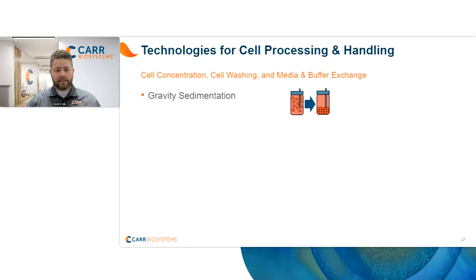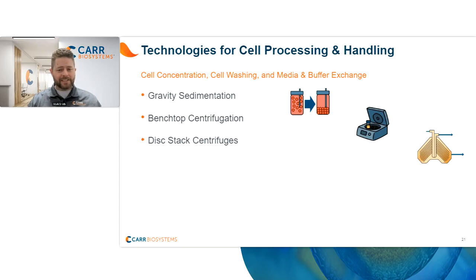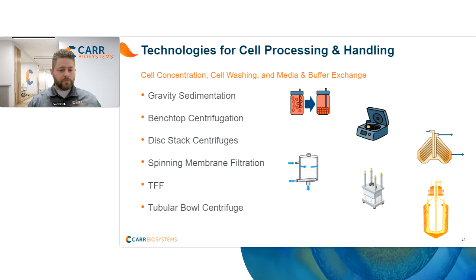Of course, gravity sedimentation is one we've seen end users using, where they simply settle out the cells. Benchtop centrifugation seems to be very popular, of course, very ubiquitous. Disk stack centrifuges, we've heard rumblings of, really haven't seen, but it's interesting technology. Spinning membrane filtration, TFF, and of course, tubular bowl centrifuge. So we'll walk through these technologies and rate them again on our experience with end users about how they fit into overall evaluation considerations for development technology.